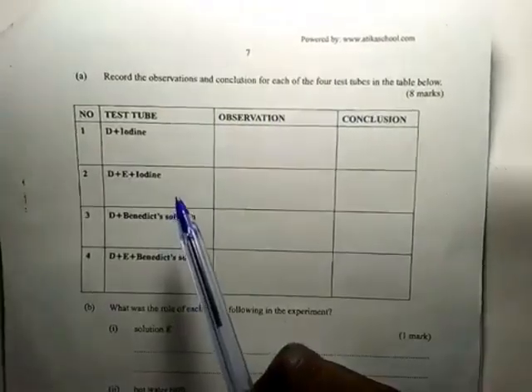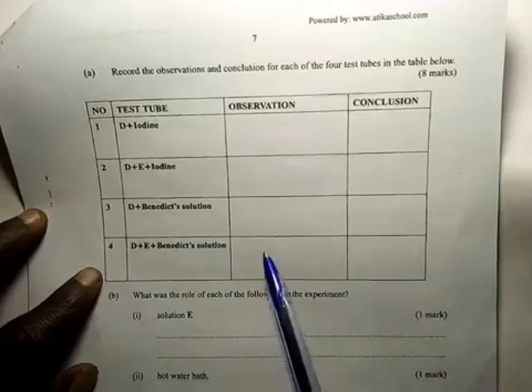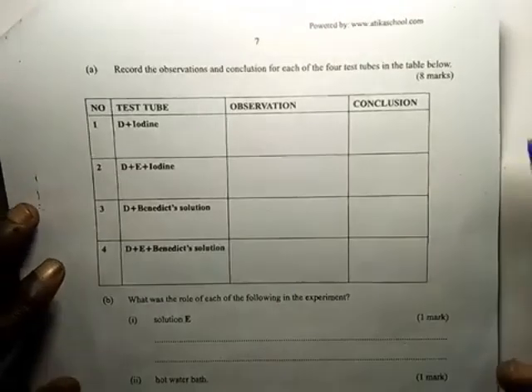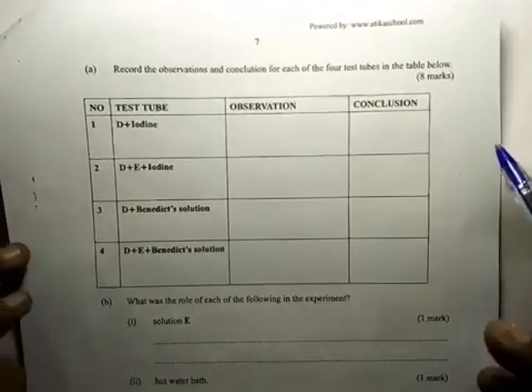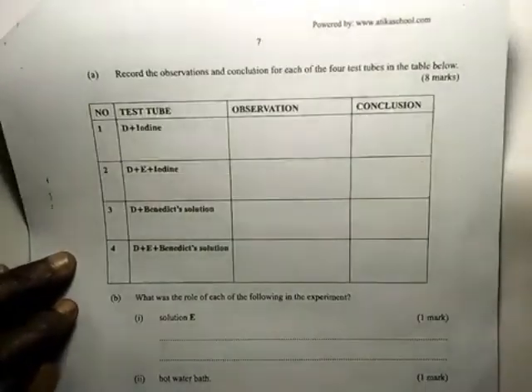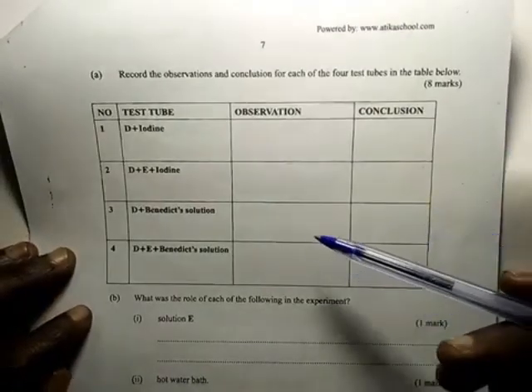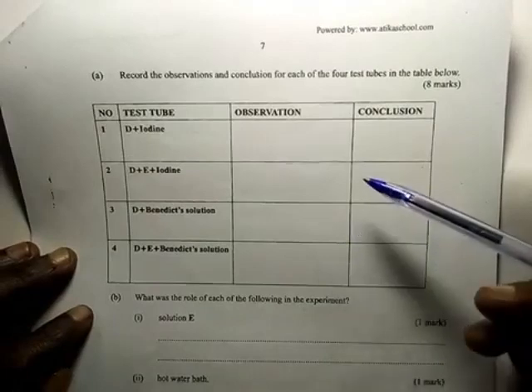A student is able to know what is being tested because you have been given starch, iodine, and reducing sugar and Benedict. Therefore, students should be able to understand this is testing for reducing sugar and starch.